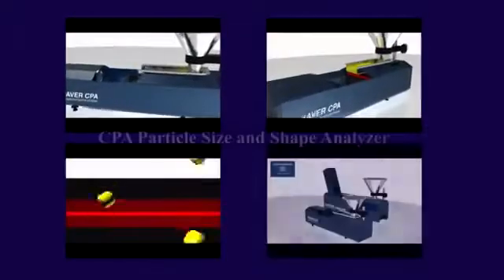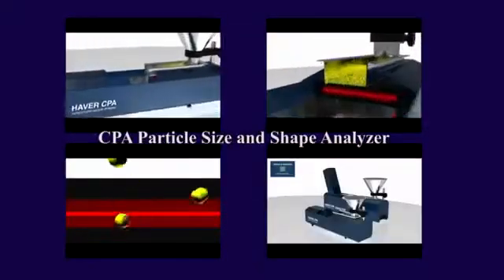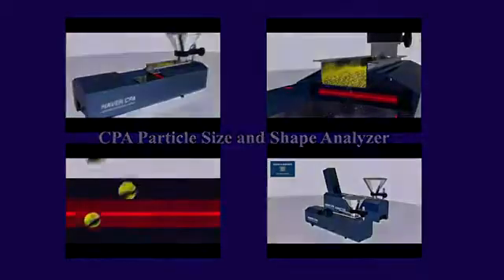Particle size distribution measurement is a critical element in the manufacturing and quality control of products in a wide range of industries. Today, new technologies include photo-optical equipment to complement particle size measurement and analysis.